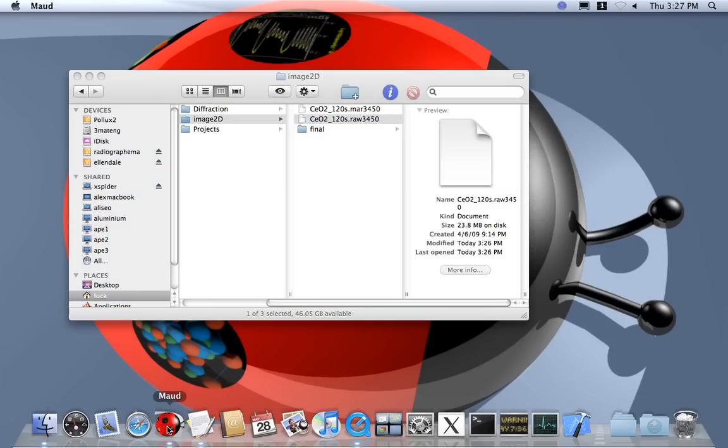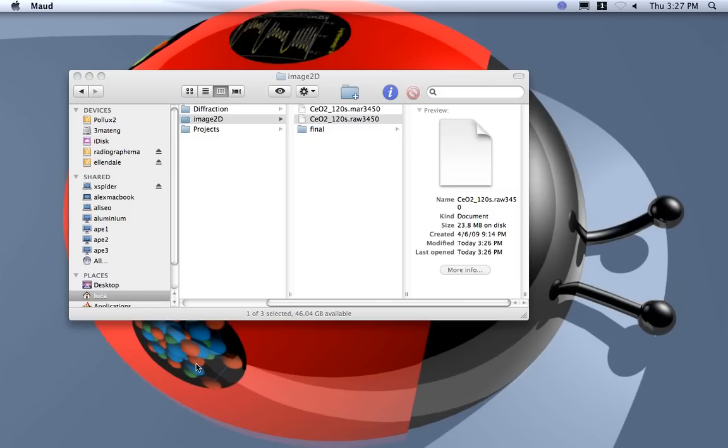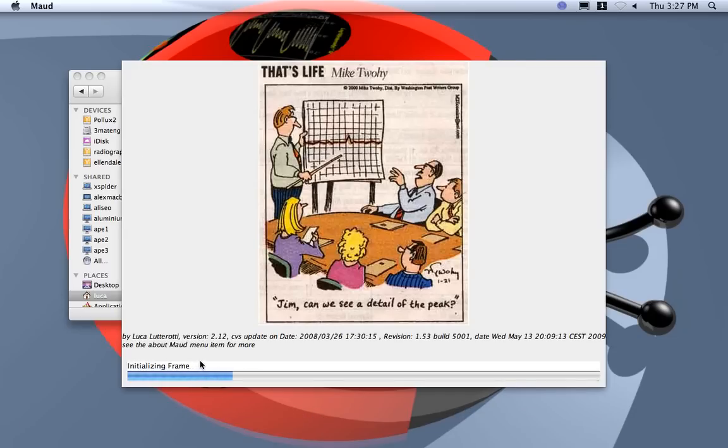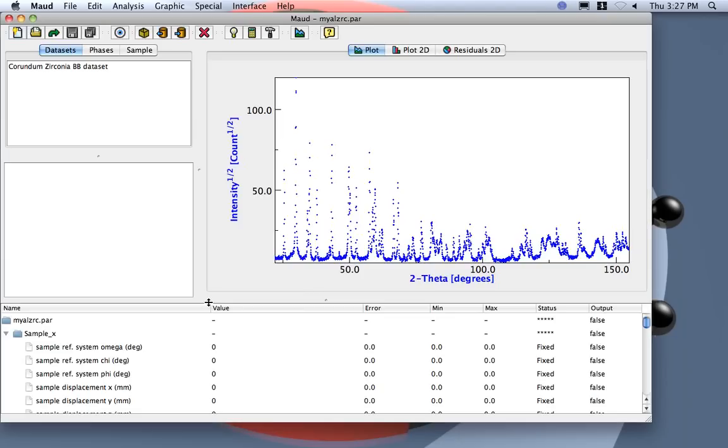Okay, starting MAUD will load the last analysis we work with. Yes, the LZRC of yesterday.